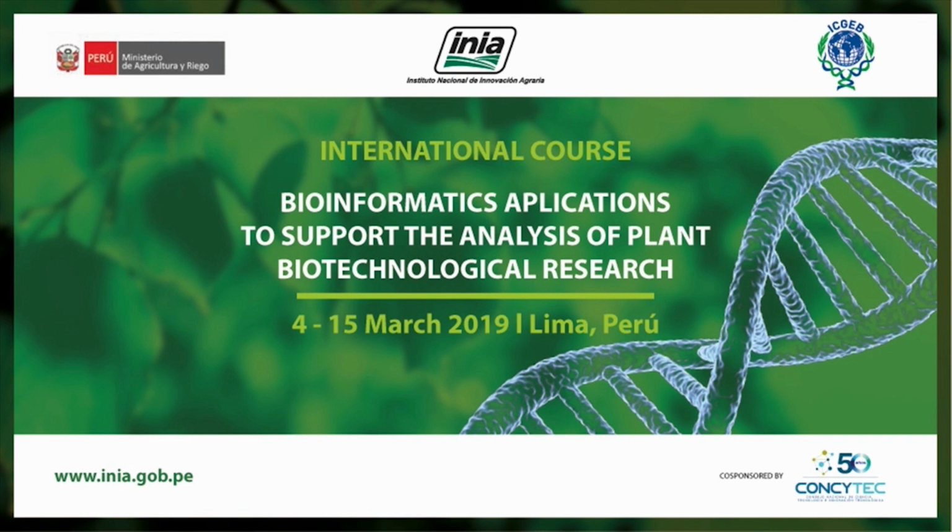Now, --infmt, the input format. Here you say what is the input you're giving. What format is the input you're giving to this file? And we all know that we're using FASTA format. We can just leave it as default because it will be auto-detected. And these tools are pretty good at auto-detecting what they're doing.